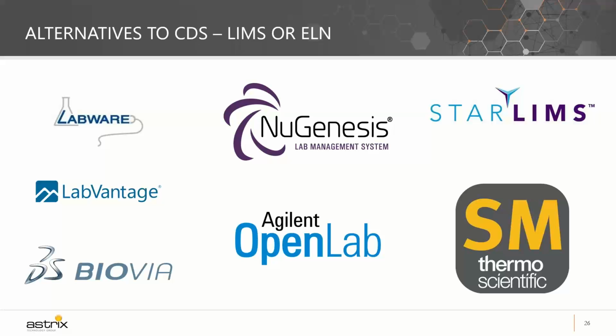So to name one example, let's say you have to send data from Empower out to one of those systems, and for some reason you have to rely on flat files like a TXT file or a CSV file. If not properly configured, those data can be accessed and manipulated externally using applications as simple as a Notepad or a Word document or an Excel spreadsheet, and then sent back to the LIMS or ELN for calculation. So you need to be vigilant and create mechanisms and evidence that this scenario can't happen.